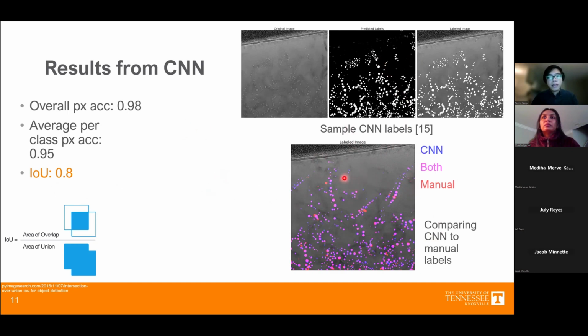So I guess when it comes to precision and recall, they should have pretty similar values, just because there's actually not a whole lot of false positives or false negatives. So I think they should have similar values, and there isn't a high imbalance between false positives and false negatives.